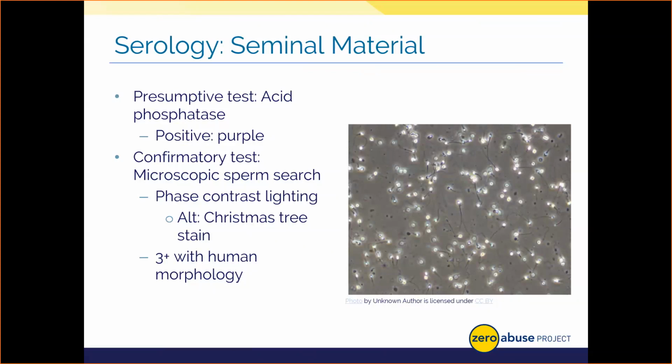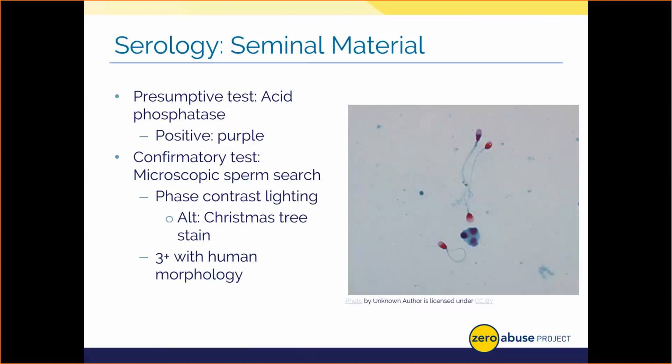And it'll hit the sample in such a way so as to make normally transparent things appear visible to the naked eye. Now, what if your lab doesn't have the expensive phase contrast capabilities, right? Well, they could use what's known as a Christmas tree stain technique. And I think you can see, for the sake of time, what happens here, right? And why we call it the Christmas tree stain.